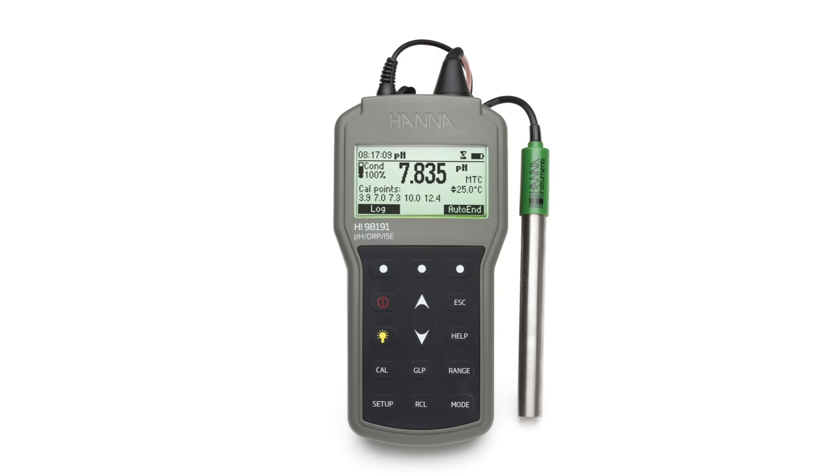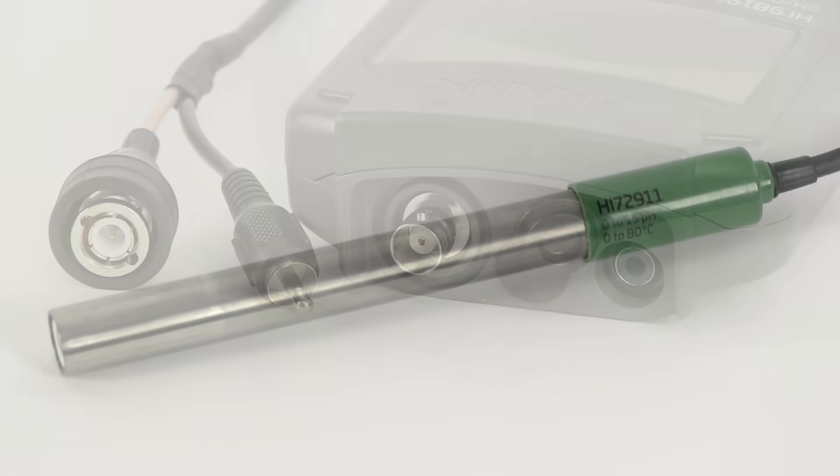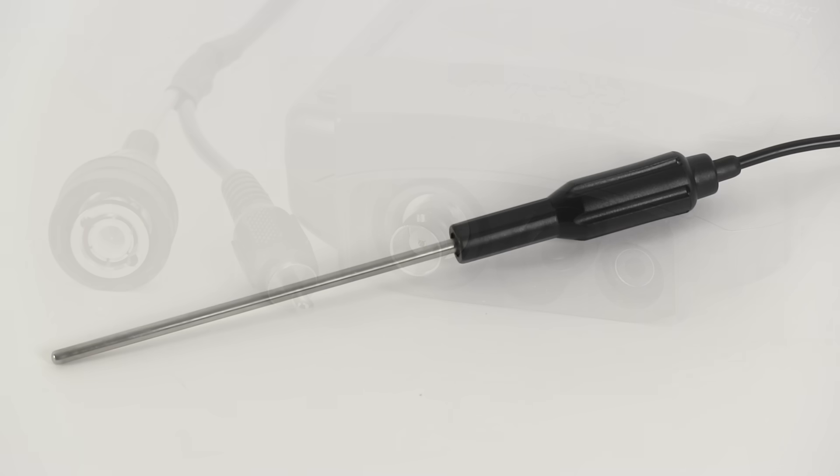The HI-98191 portable pH millivolt ISE meter comes with the HI-72911B combination gel-filled pH temperature electrode, which connects to the meter with a single cable that has a BNC connector for the pH electrode and an RCA connector for the built-in temperature sensor. The HI-7662 temperature probe is also supplied with the HI-98191 to be used with an optional ion-selective electrode of your choice.